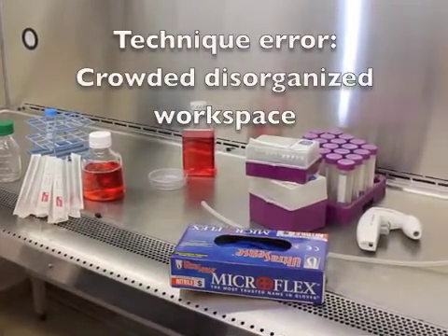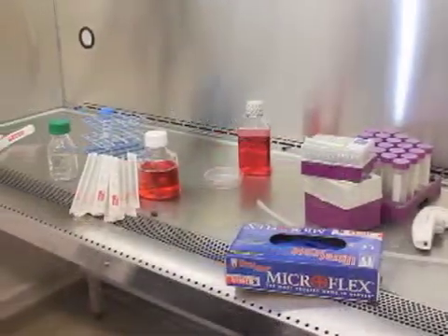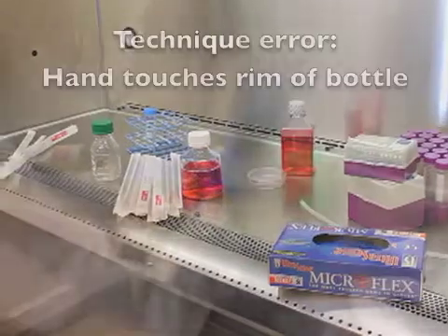One of the easiest ways to understand good aseptic technique is to become aware of common mistakes that lead to contamination, things that you should avoid when doing mammalian cell culture. A disorganized or overcrowded workspace in the hood can obstruct airflow and lead to technical errors.